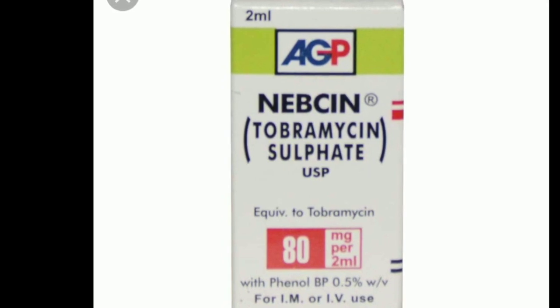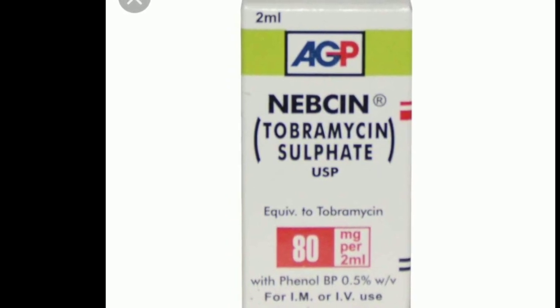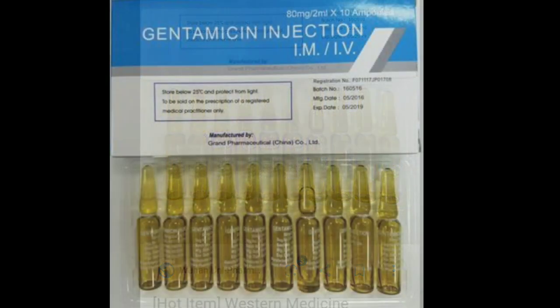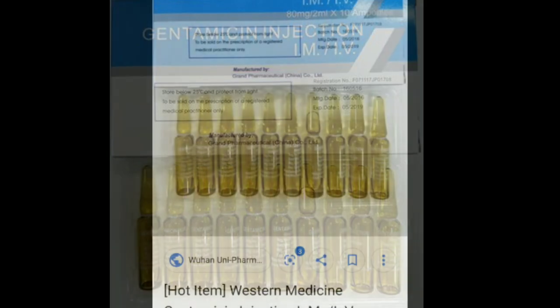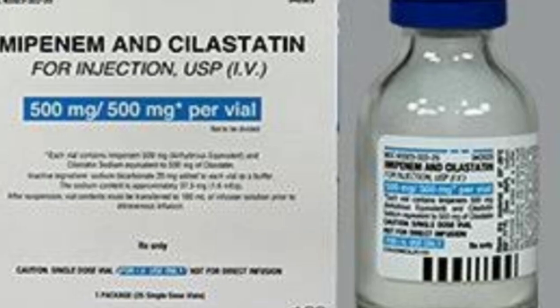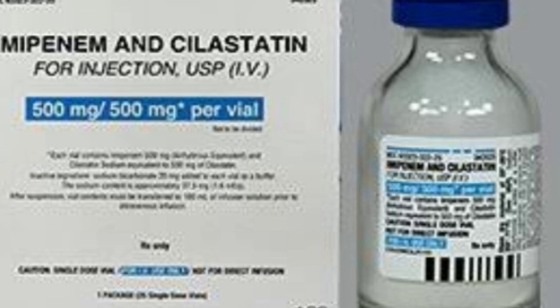Here you can see tobramycin and gentamicin injection. The next one is imipenem, used for very resistant infections. Its topical dose is 1%. Put 10 ml distilled water into a 500 mg vial, then take 1 ml and dilute it further with 4 ml distilled water to make it 1%, or 10 mg per ml.